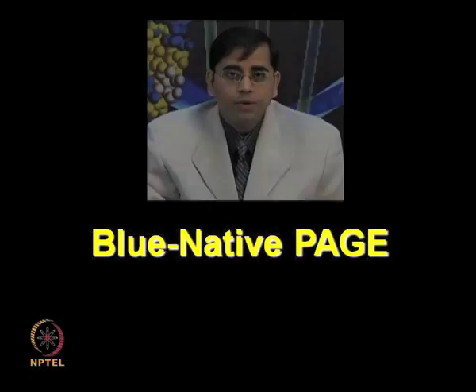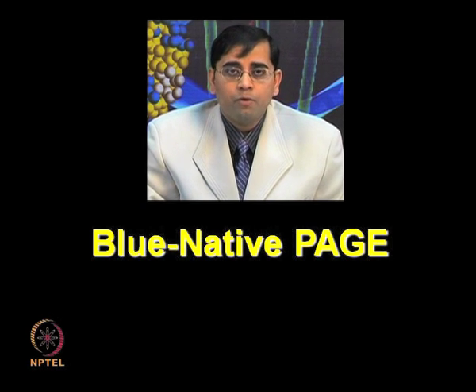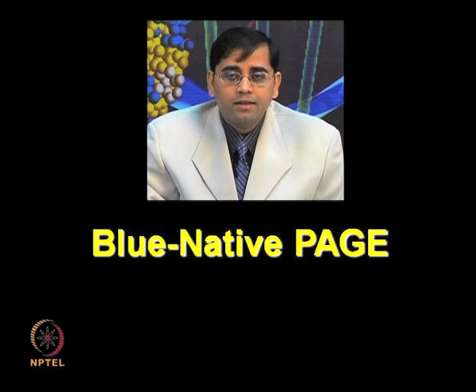So, let us now move to a variation of SDS-PAGE known as blue native PAGE, blue native polyacrylamide gel electrophoresis. Now, in SDS-PAGE, we are providing a denaturing environment. We want to denature the protein, whereas in the blue native PAGE, we want to separate the proteins in their native condition. And by applying these two techniques together, one can obtain very unique and different information, often related to the isoforms, subunit composition, molecular weight and different type of post-translational modification.